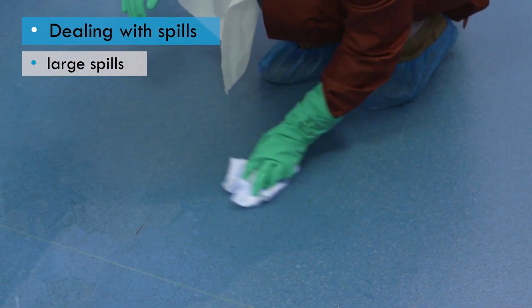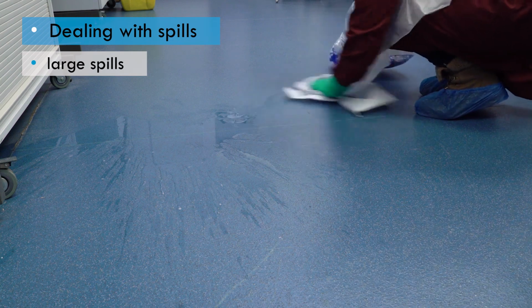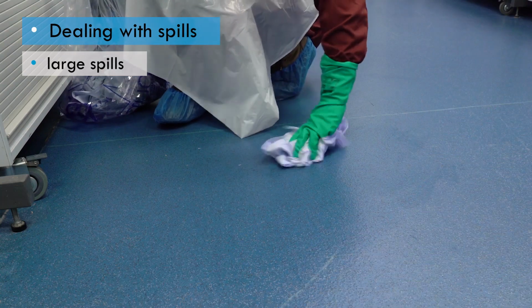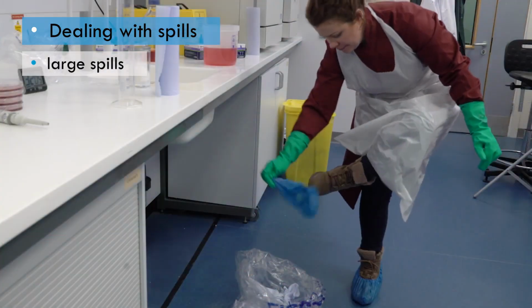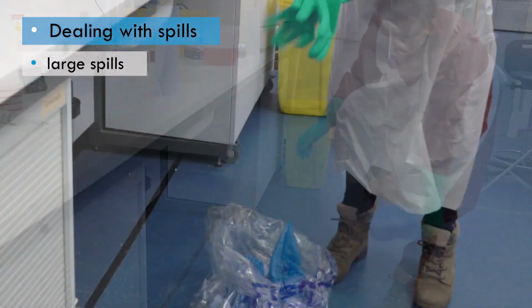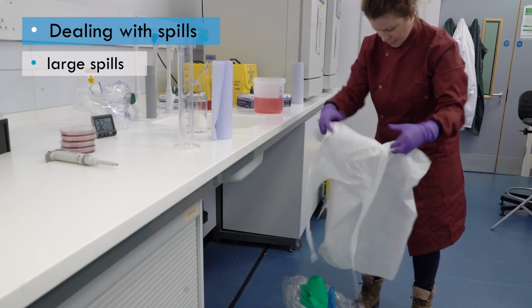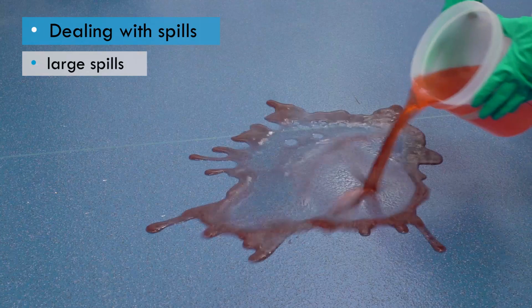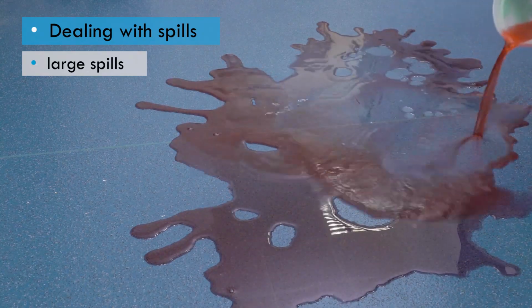Work slowly to reduce any splashing and wipe from the outer edges towards the center of the spill so that you don't increase the area of contamination. Once the spill has been mopped up, change gloves and other PPE to avoid cross-contamination. The spill area can then be decontaminated with disinfectant, following the general guidelines.